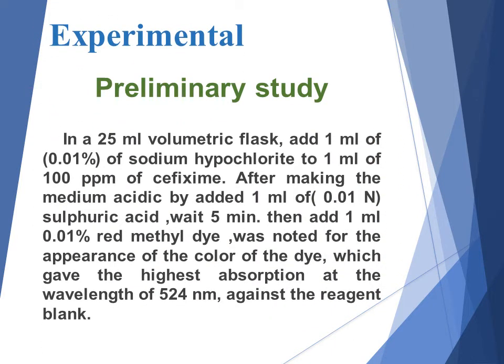Preliminary study. In a 25 ml volumetric flask, add 1 ml of 0.01% sodium hypochlorite to 1 ml of 100 parts per million of cefixime.